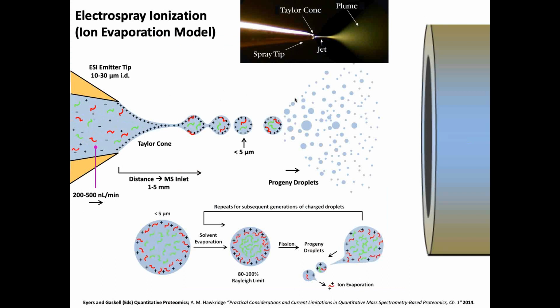And so those guys are really tough to ionize if they're competing with something else in the droplet that is more hydrophobic, because that more hydrophobic species will go to the surface over staying in the core of that water-organic matrix, if you will. Okay, so there's this interplay between what stays on average in the center versus what gets to the surface, which is where all your charge is and where it's going to eventually get enough energy to release from that droplet and become a standalone analyte, protein, peptide, carbohydrate with a charge on it.